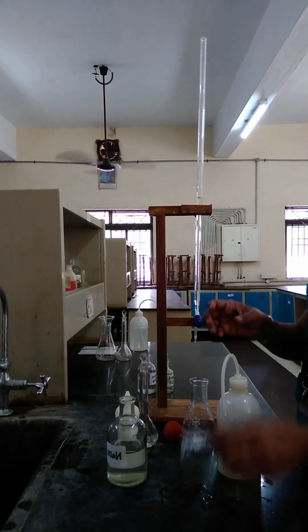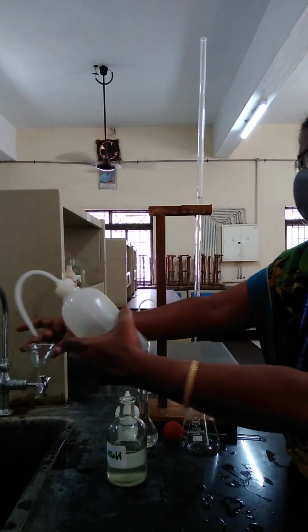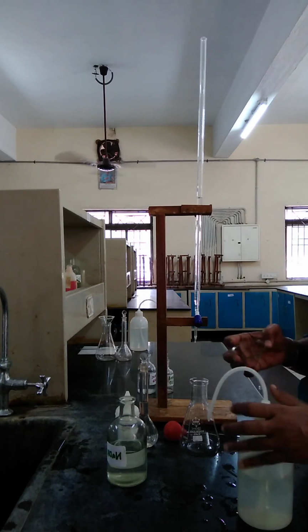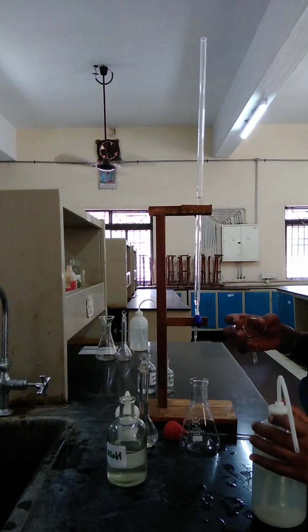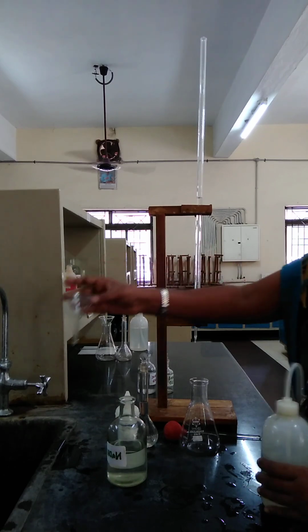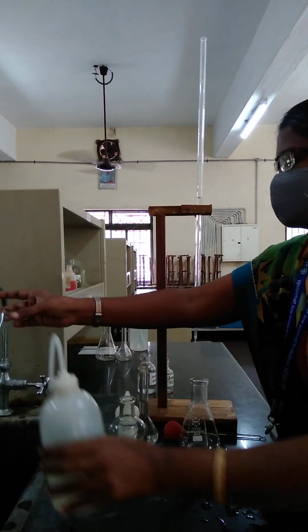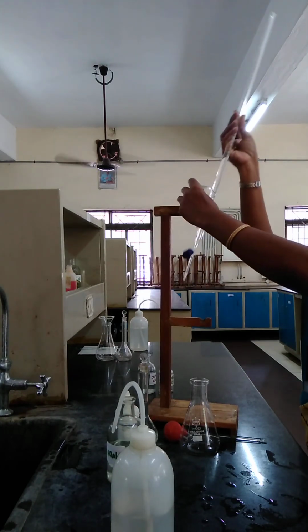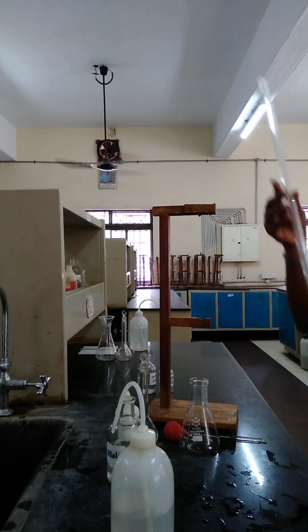Now from this 100 ml sample you can do titration 5 times. If you add excess indicator or excess sodium hydroxide solution, you can repeat 4 more times, no issue.